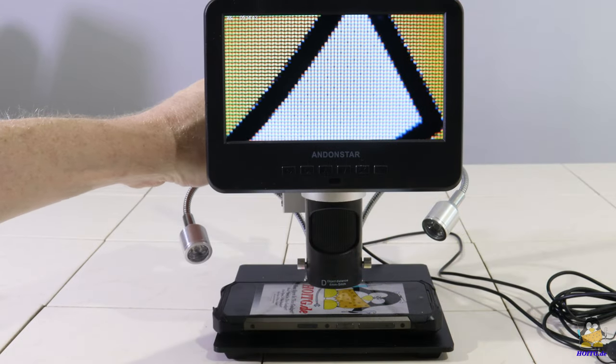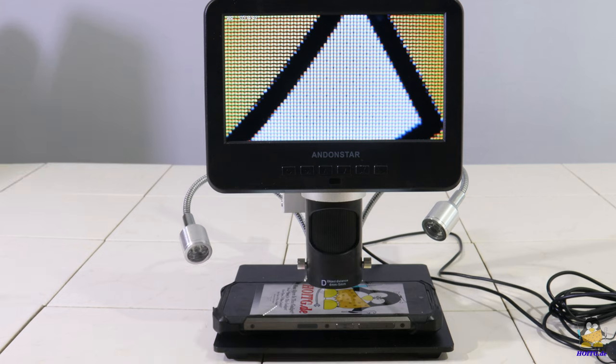For the third lens I only use the smartphone screen as reference. The magnification rise between 66 pixels.